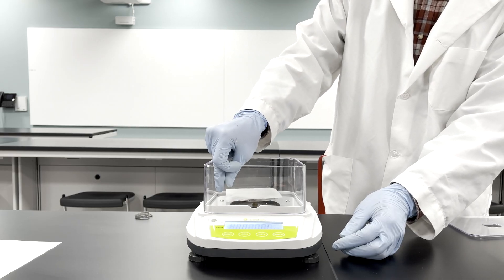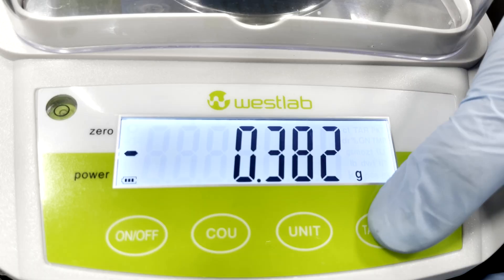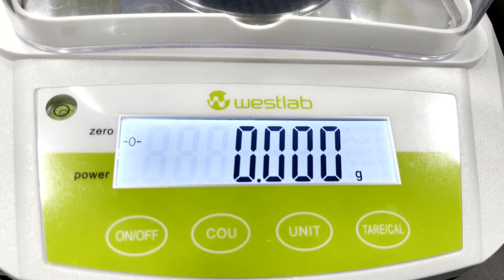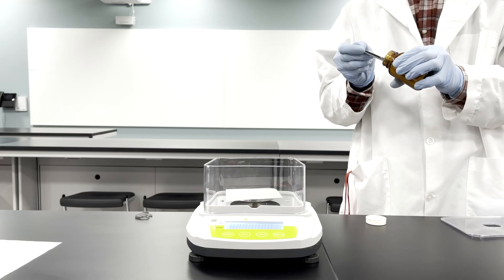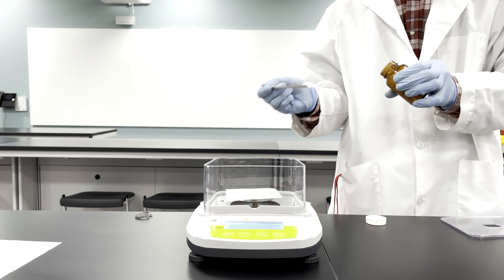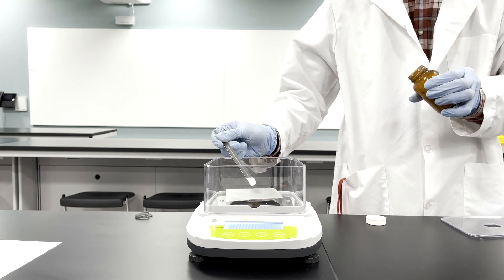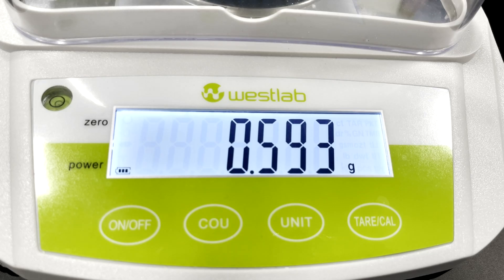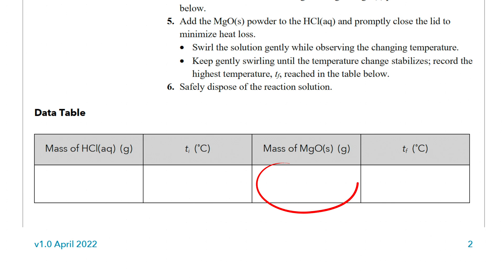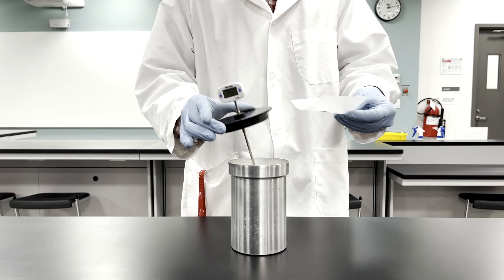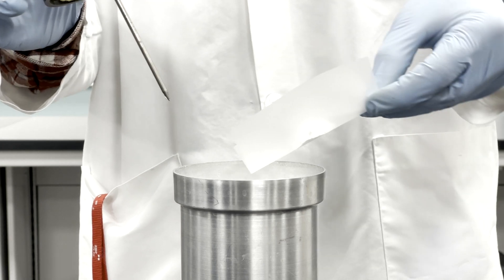Place weighing paper on the electronic balance and zero the balance. Using the spatula, add between 0.5 and 0.6 grams of magnesium oxide to the paper. Record the exact mass in the data table. The magnesium oxide is then added to the acid in the calorimeter.